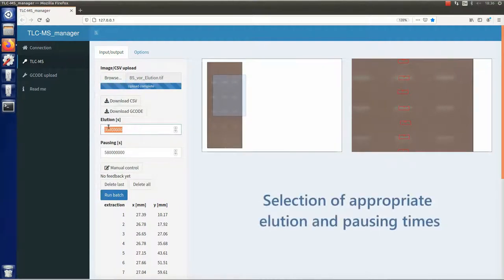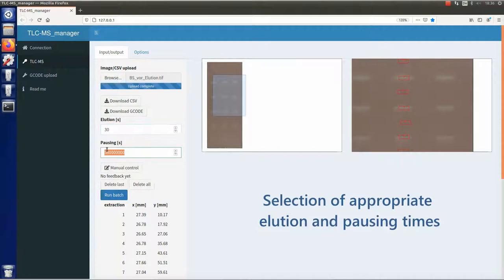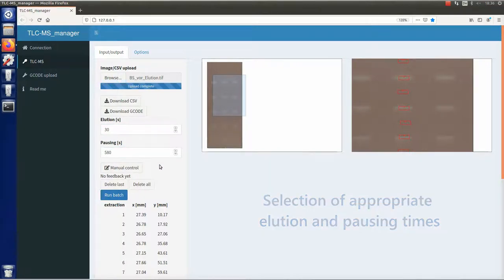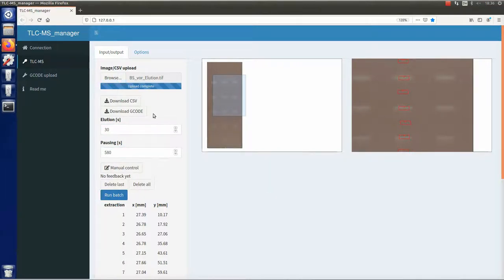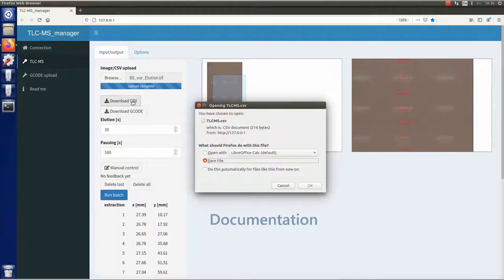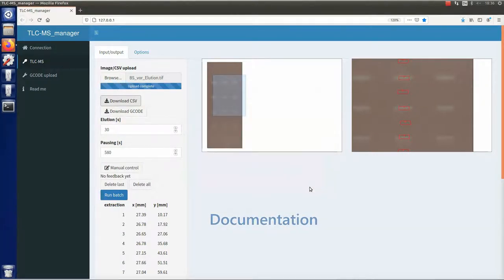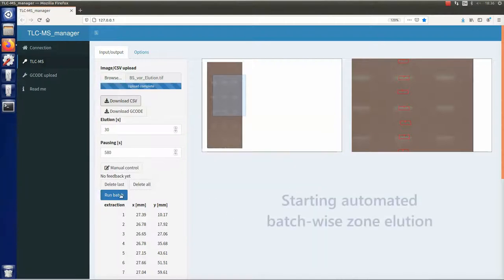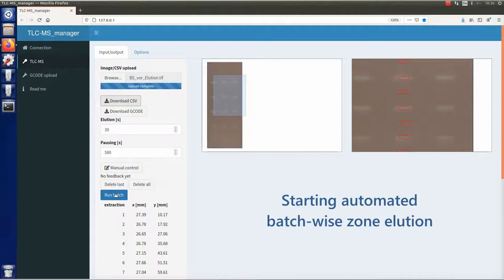Elution and pausing time suitable for the analytes must be selected. The batch can be documented by downloading the elution order and the chosen positions as a CSV file. Now everything is ready for automated batch-wise zone elution.